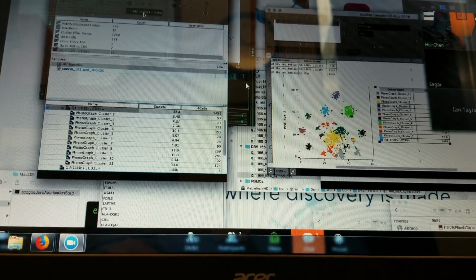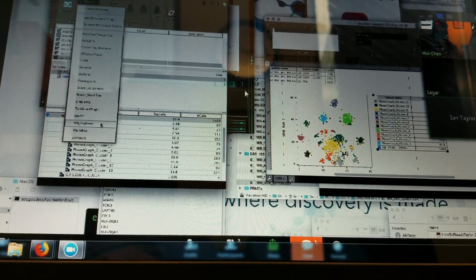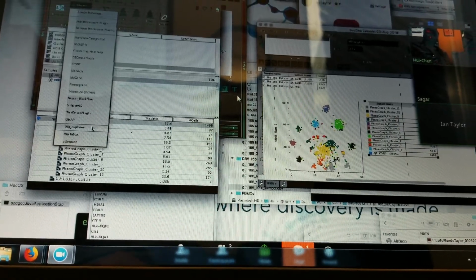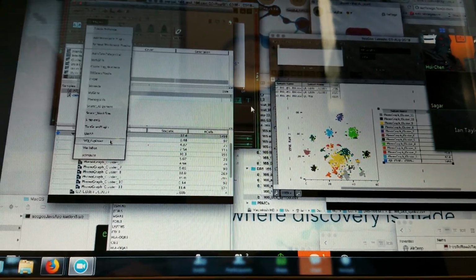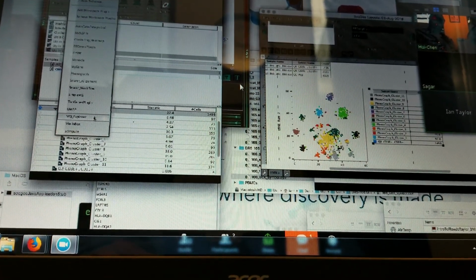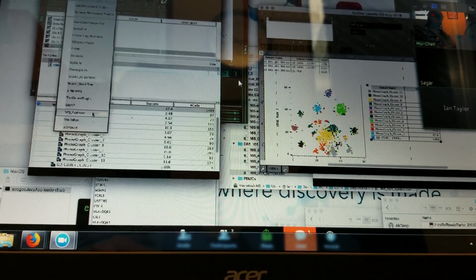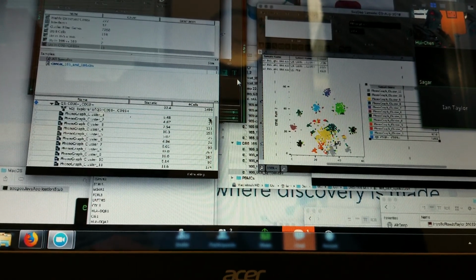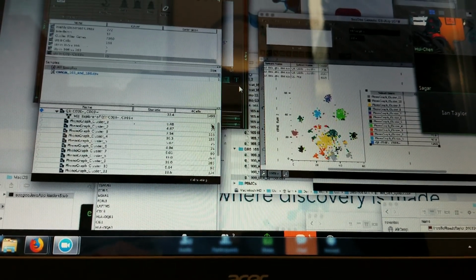I was thinking of even what's the phenotype of the B cell or what the gene collection is in each cluster. We could do differential expression analysis on each cluster and get back an upregulated gene set that defines each of those clusters. We kind of went over that a little bit, so you saw how we can create volcano plots to do that. Okay, so we'll try that. And now we're going to look at the VDJ. That'd be good. Let's see how this works.